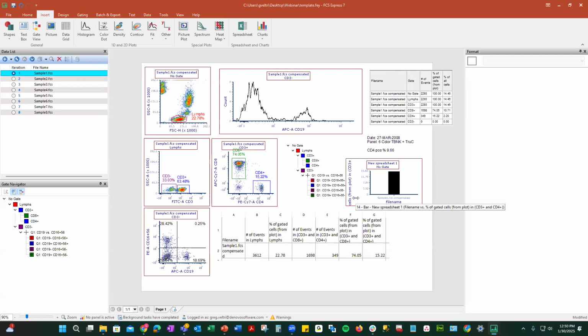Okay. And let me look up real quick, two questions that might be answered soon. Is there an option to group samples? And how do batch action reports work when you have sample-specific gates, perhaps group-specific gates? So batch actions work if it's a data-specific gate the way that I did it, it's going to be specific to that data file. So when I do the batching, it will work that way.